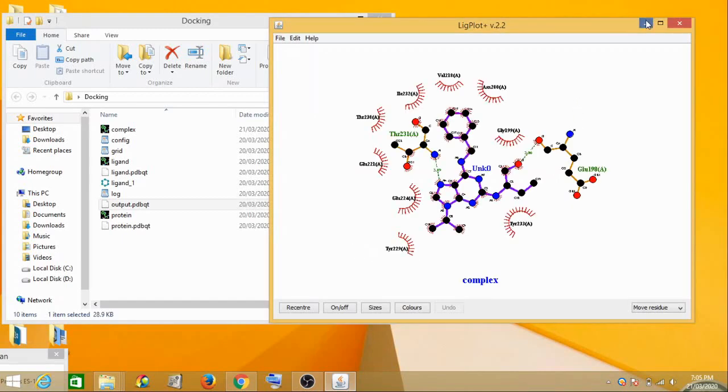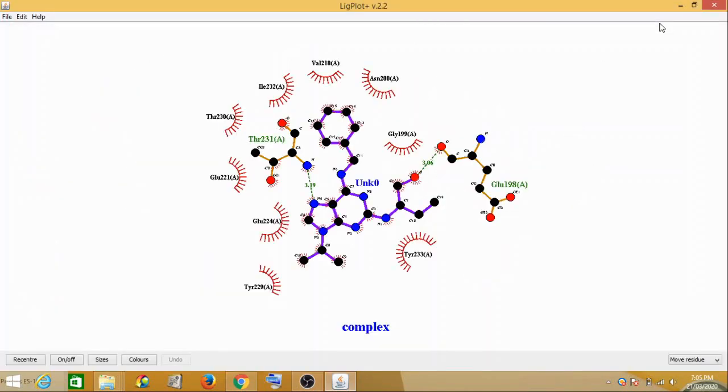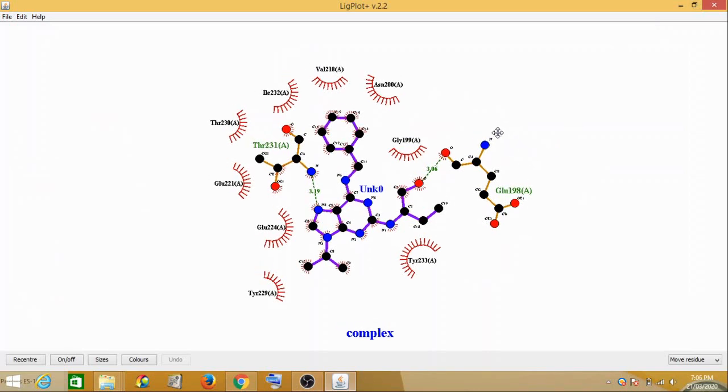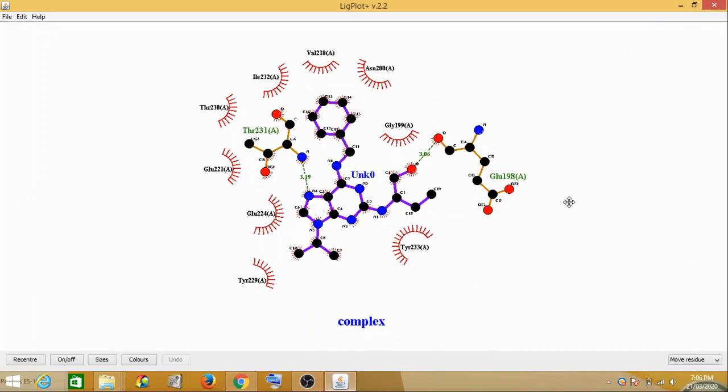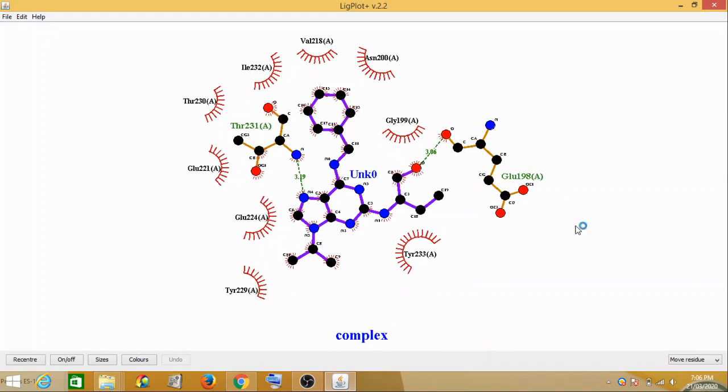Yes, so this is your ligand interaction file which has opened. These are your neighboring amino acid residues for the pocket region.